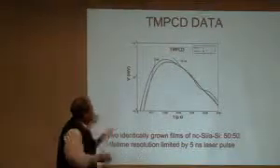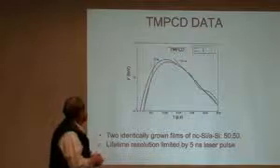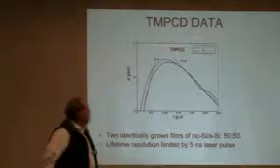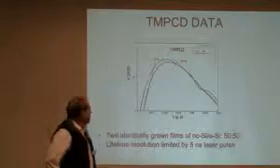So the asymmetry is caused by the finite decay of minority carriers in the sample. Students have attempted to do a deconvolution of this, but a rough estimate is the lifetime is probably 9 or 10 nanoseconds, the difference in the symmetry of these two decay curves.